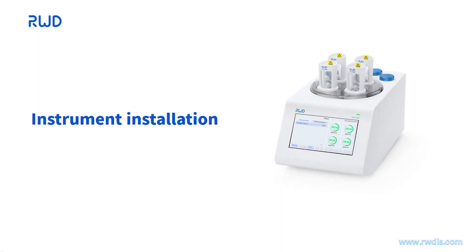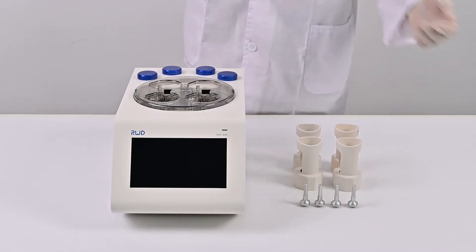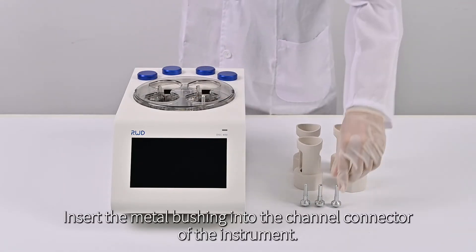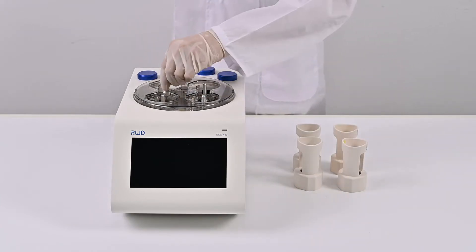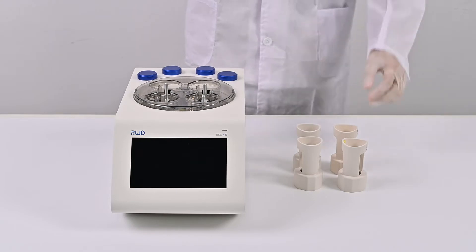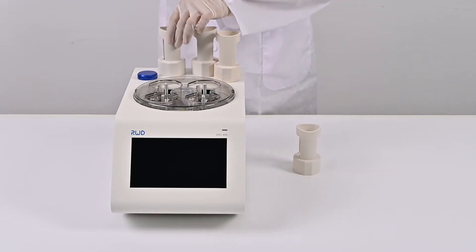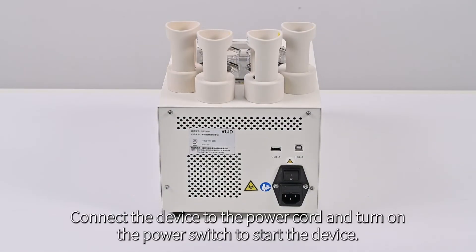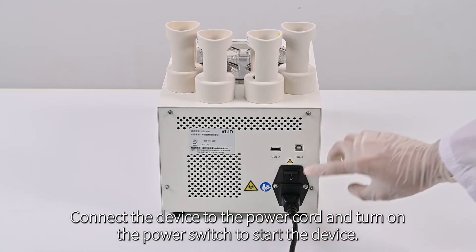Instrument Installation. Place the instrument on a stable operating table. Insert the metal bushing into the channel connector of the instrument. Place the heating jacket on the blue cylinder for spare use. Connect the device to the power cord and turn on the power switch to start the device.